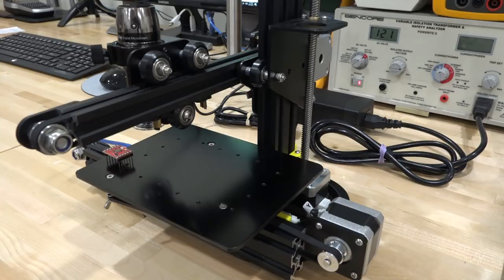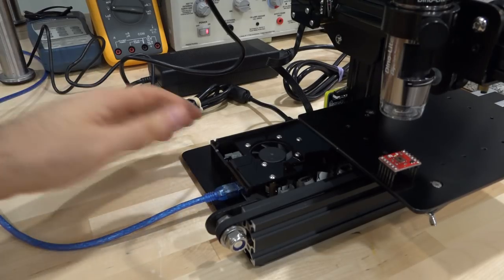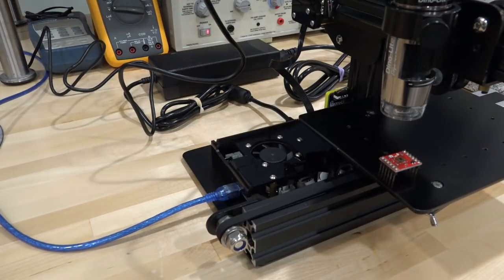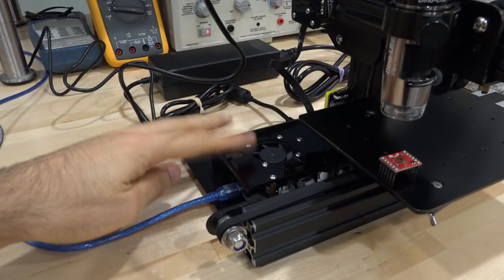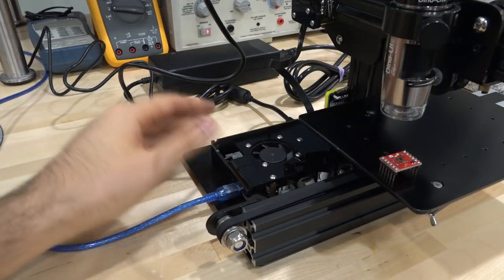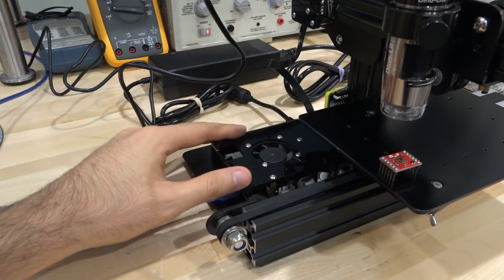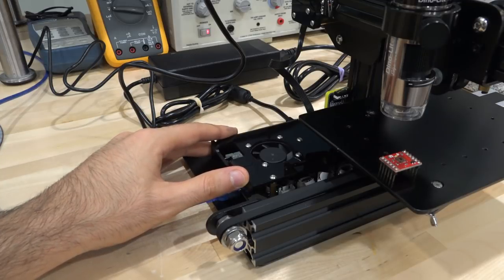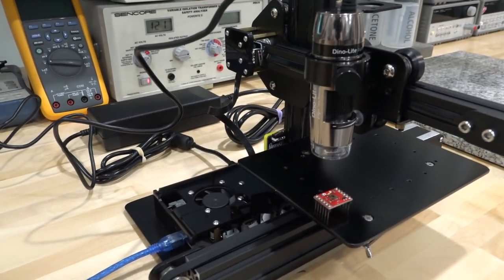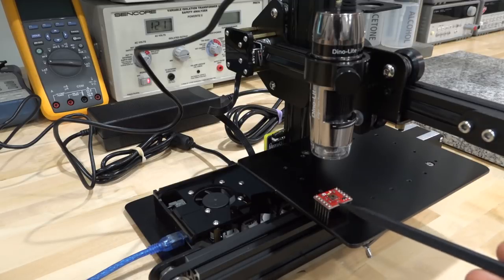On the other side, all the connections you need is just one USB to the computer and power from the provided power supply, which is quite large. There is a micro SD card reader on here, so maybe some automated measurements can be made. I'm fairly sure this should be easily hackable for other purposes. Now I have the high magnification unit right over here with the light pipe in it, and I have something I want to take a look at. Let's first turn it on and see what it does when it initializes for the first time.